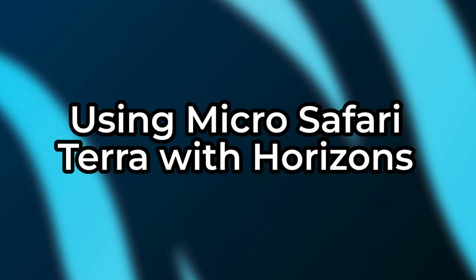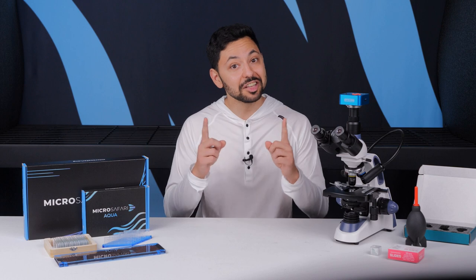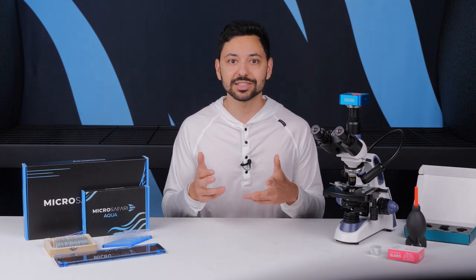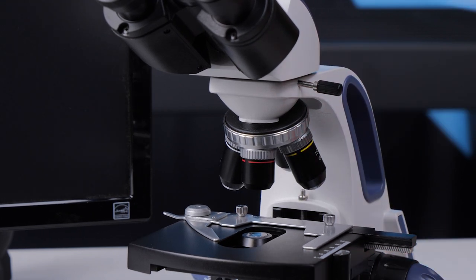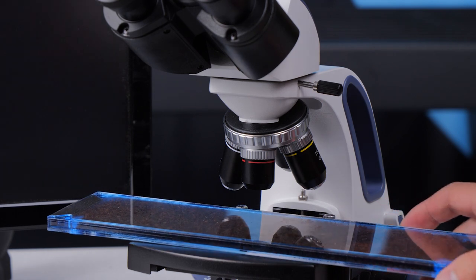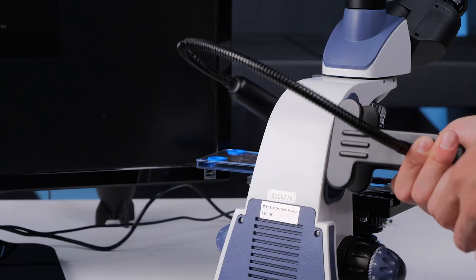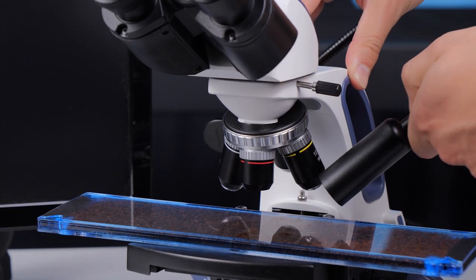Using MicroSafari Terra with Horizons. For instructions on how to care for MicroSafari Terra see the MicroSafari Terra setup video. Otherwise here's some advice for using it with Horizons. Move the stage all the way down and place Terra on top of the slide holder. I recommend starting in the very middle of the slide. You'll want to use the microscope in reflected light mode. Clamp the gooseneck light onto the back handle of the microscope and point the light at the viewing area and bring it as close as you can.